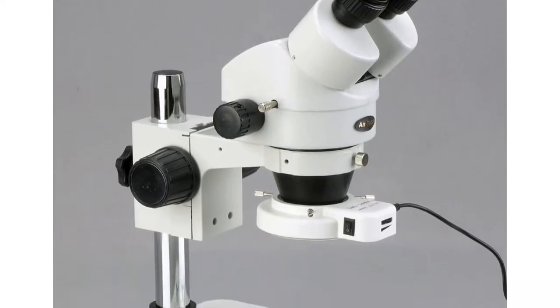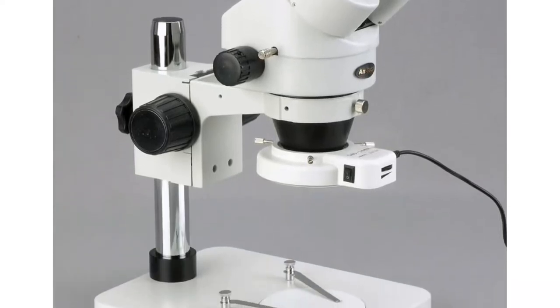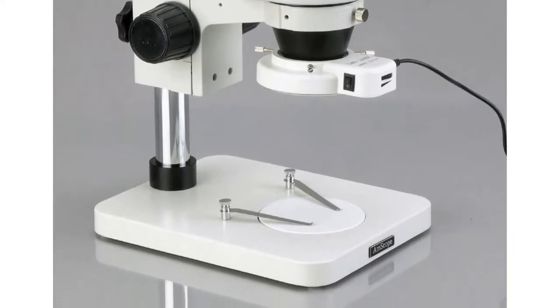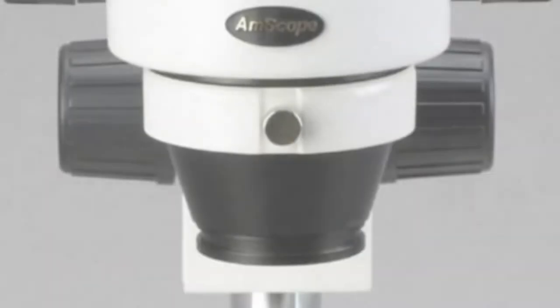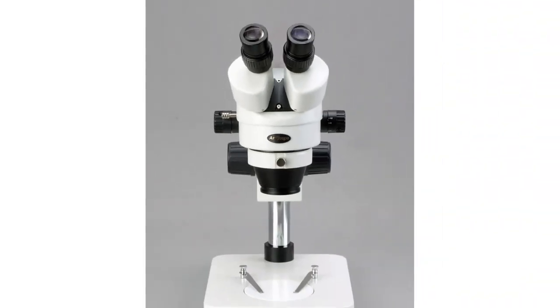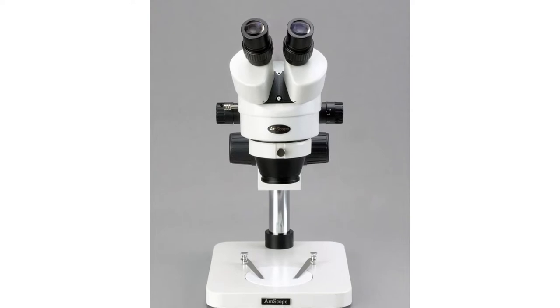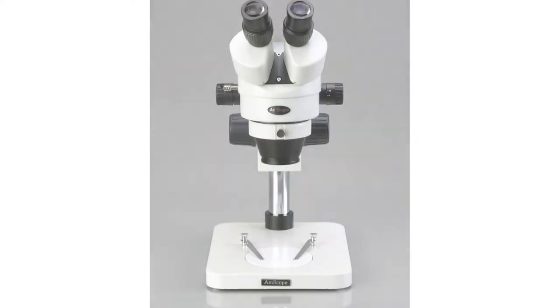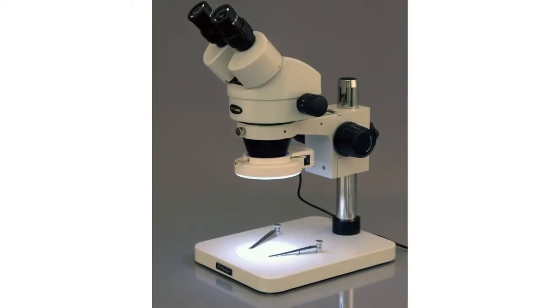Overall, this setup is best for those with glasses or goggles. Sometimes the illumination that comes from a microscope isn't sufficient for your needs. Fortunately, the SM1BSX54S from Amscope comes with a 64 bulb light to illuminate the deepest, darkest corners of your subject so that nothing misses your gaze. Best of all, the light is removable for added convenience.